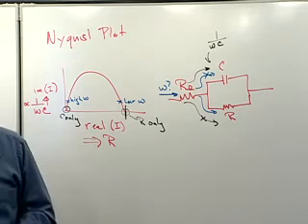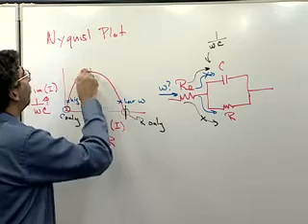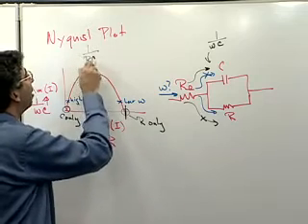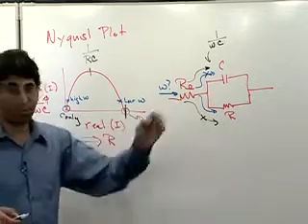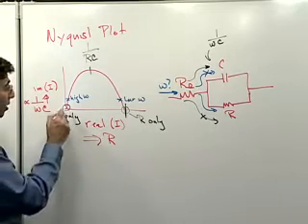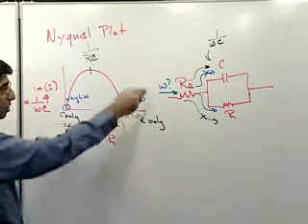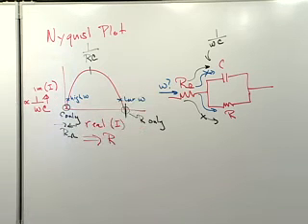And you can show that when you're right in the middle of the semicircle here, that's 1 over the RC time constant for this. Now, the resistor I'm talking about is this resistor down here, not this R sub omega, because everything obviously passes through that. That will be an offset to this curve. To the extent that R omega exists, that will just push this curve down the axis. So without doing any math, it's pretty easy to see what's happening here.